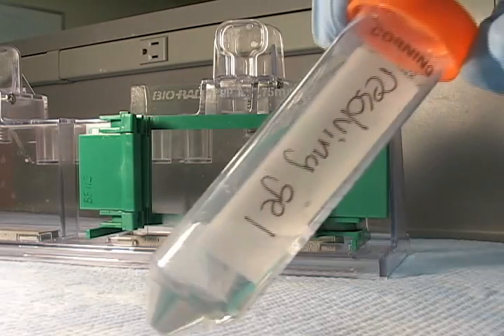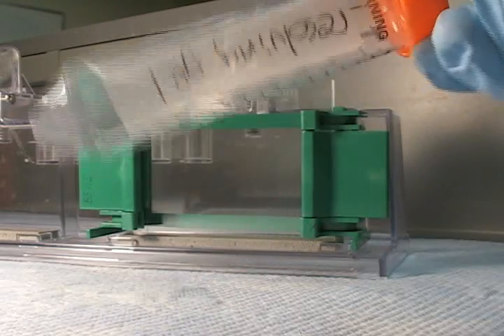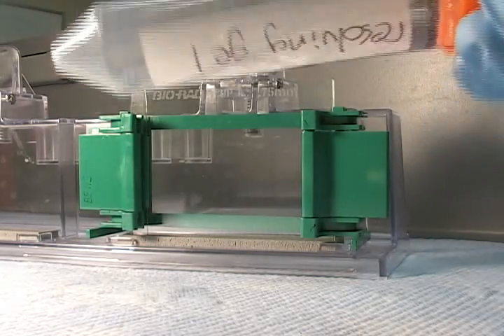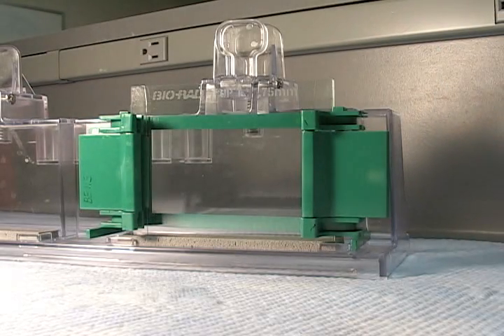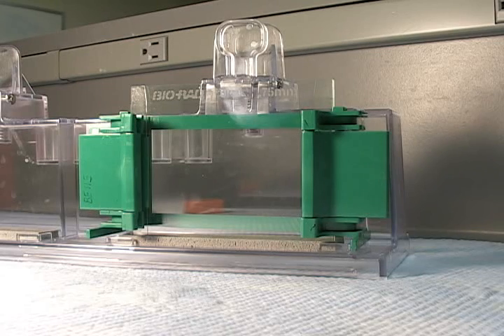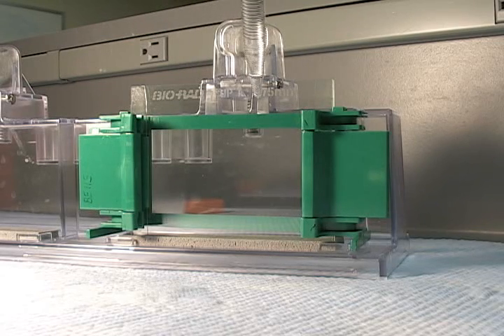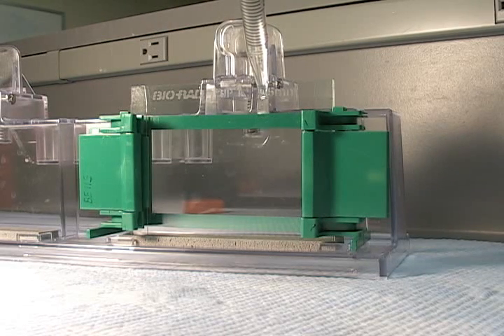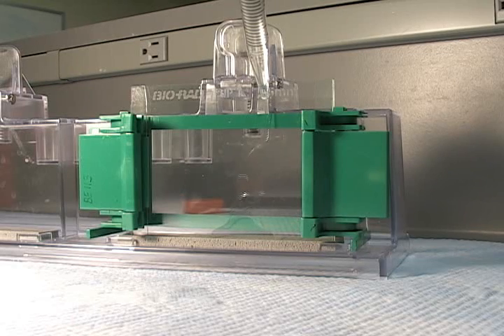I've just added my APS and Temid to this tube. I'm going to mix gently and then load the ready-to-polymerize acrylamide solution in between the glass plates. I want to do this relatively quickly. I don't want to give the gel time to form in the tube.